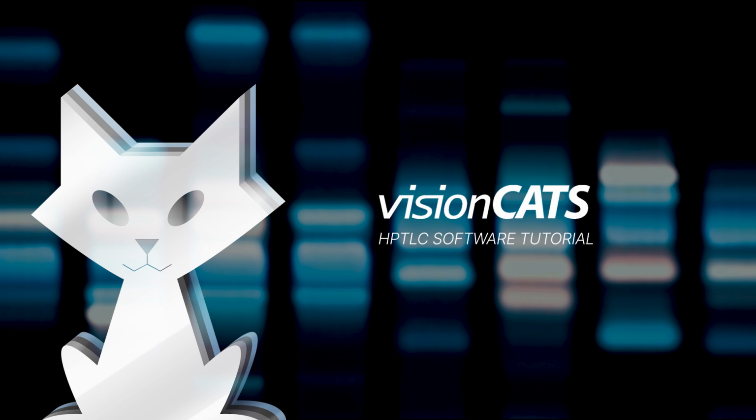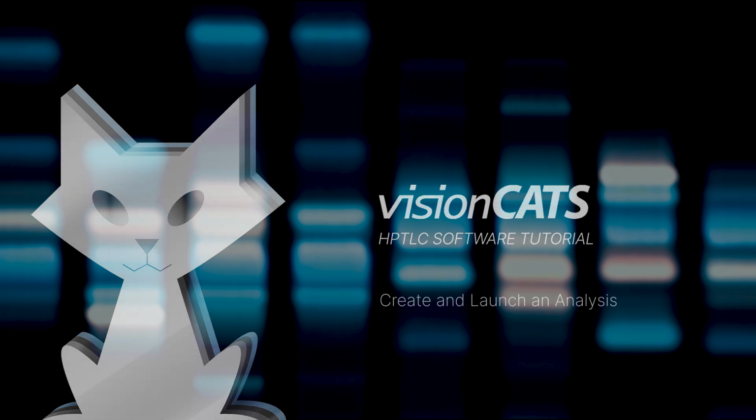Welcome! In this tutorial, we'll guide you through creating and launching an analysis in visionCATS.